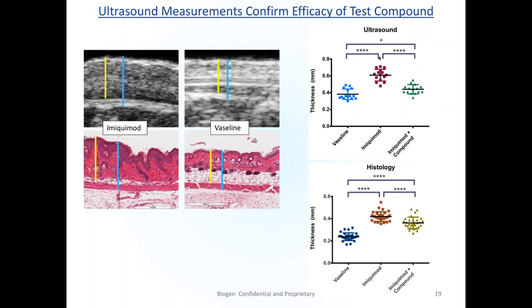We also discovered the window we needed to stay within, because the second model I described is a 14-day study, so you have some hair growth starting on about day 9 or 10. Fortunately, we were able to get enough of a phenotype and a measurable signal to distinguish the treated groups from the controls. It was an additional factor that we had to work around, but it wasn't limiting.